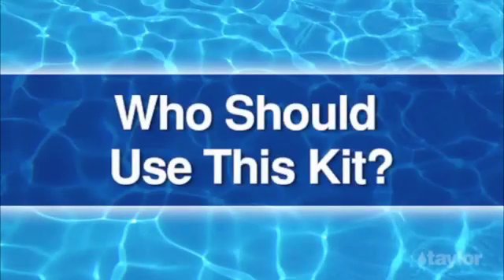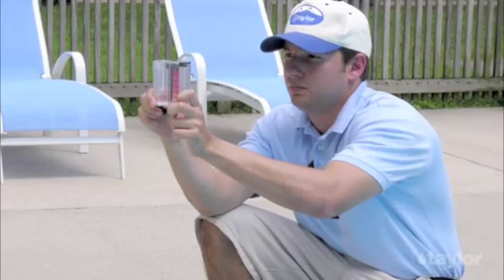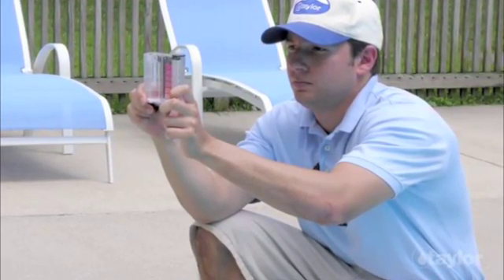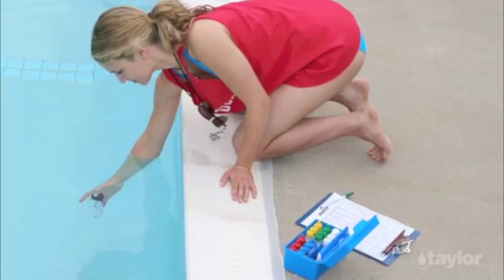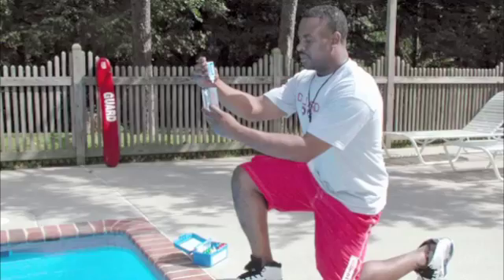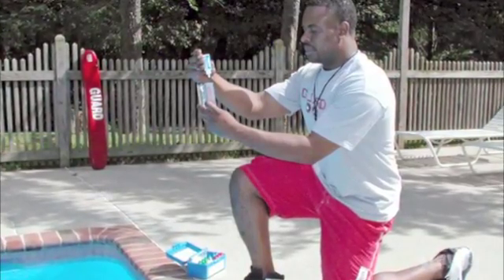Who should use this kit? The Complete FAS DPD Test Kit K2006 is specifically designed for service technicians, operators of commercial aquatics facilities, health officials, and other professionals whose responsibilities include monitoring water quality in public pools or spas. Homeowners who want to be more exacting about their water testing regimen will also find this kit useful.